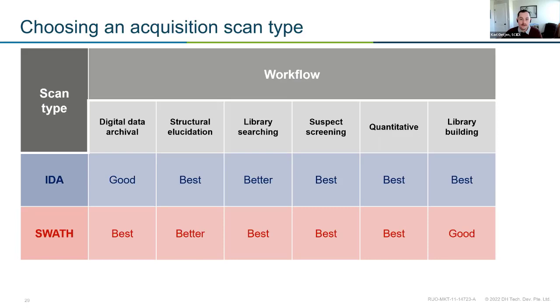The other thing that I think is super important is the ability to archive your data. So in the past, right, we stick our samples in a -80, where they sit for anywhere between, at least in my experience, 10 to 30 years before they eventually get thrown out when the freezer gets thrown out. But here we have the ability to actually just archive those digitally. So we can go through and investigate or ask new questions, interrogate our samples in a different manner.